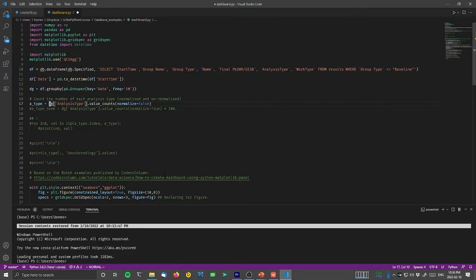Now this DG function here will actually return a Pandas series, but it can look a little bit strange. So I thought I would just show you what it looks like. I'm going to do that by printing out, as we go through the values of the index of this series, as well as the values of the series. We're going to print both the index and the value as we go through the series. And I'm also just going to print out this little line here, and we'll come back to that in just a sec. So let's do that now in Iolite.